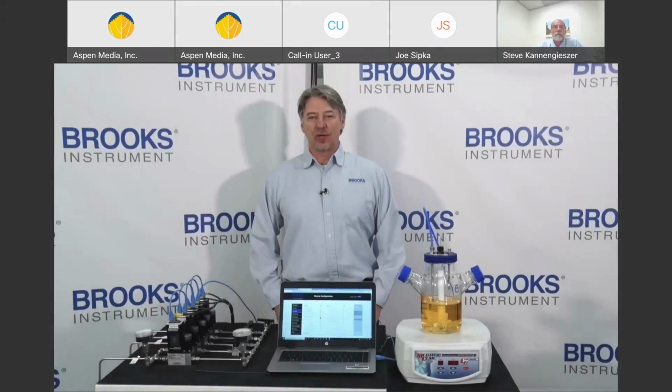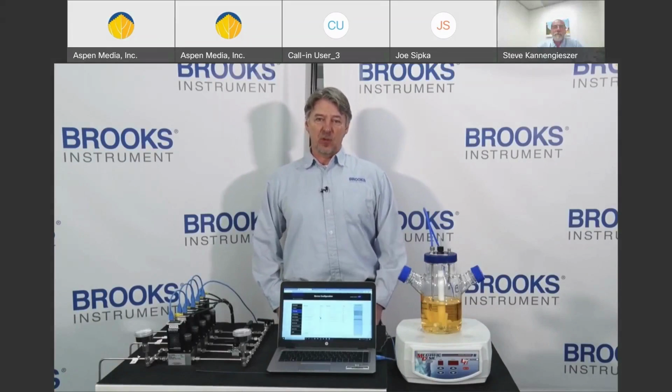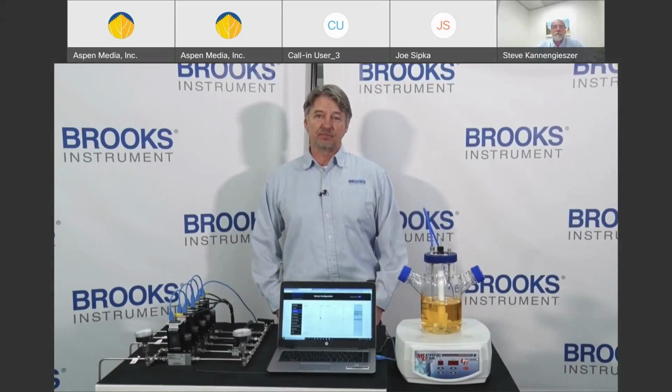Hello, my name is George Dory. I'm part of the technical service team at Brooks Instrument. Today I want to talk about how you can utilize your Brooks Instrument thermal mass flow controller to potentially prevent damage to a bioreactor batch recipe.